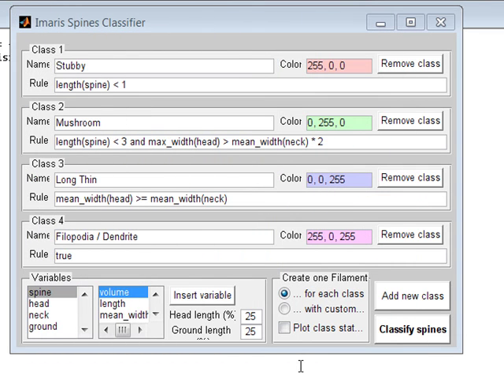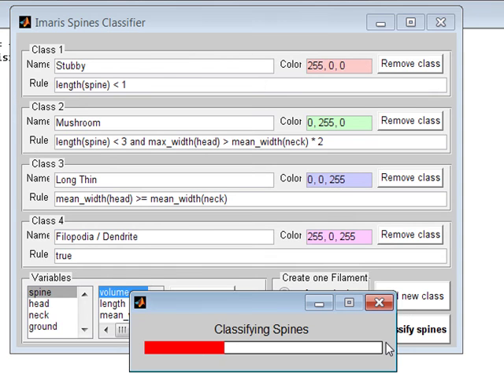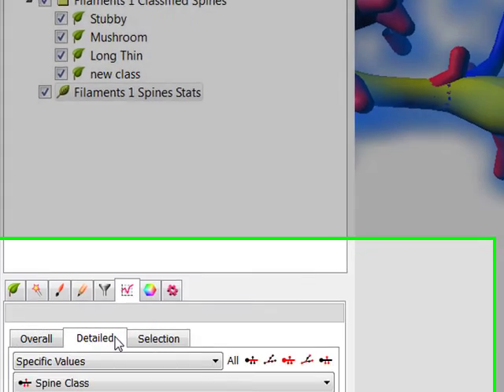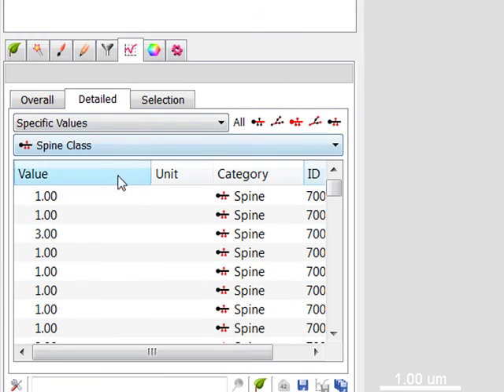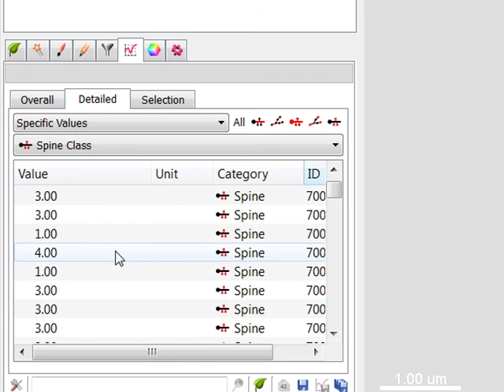The option Create one filament with custom statistics produces one new filaments object in the surpass tree. Under the Statistical tab, a new variable spine class is added. The spine class matches the rule number.